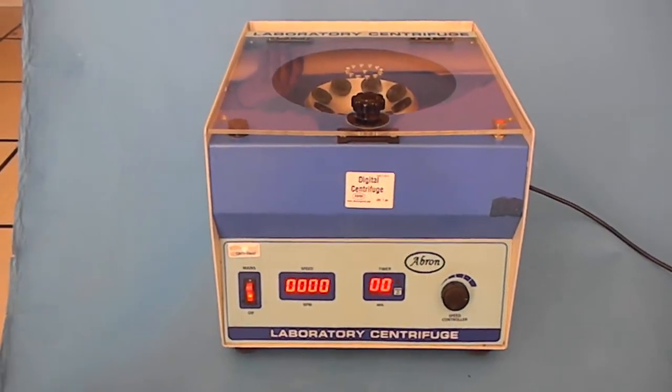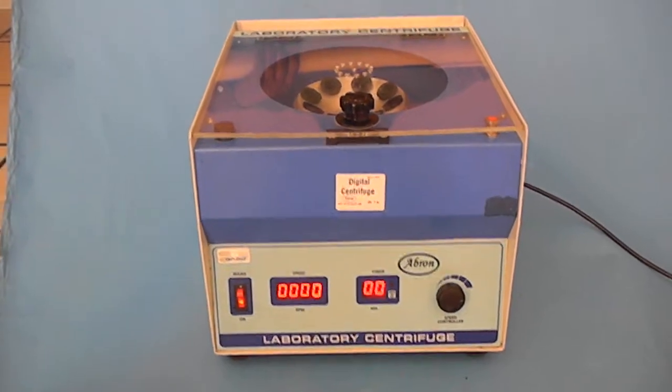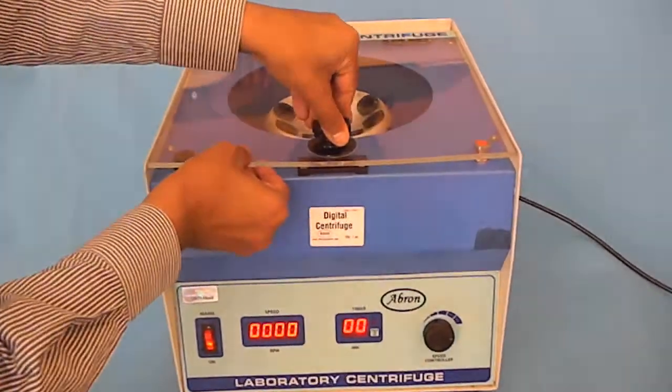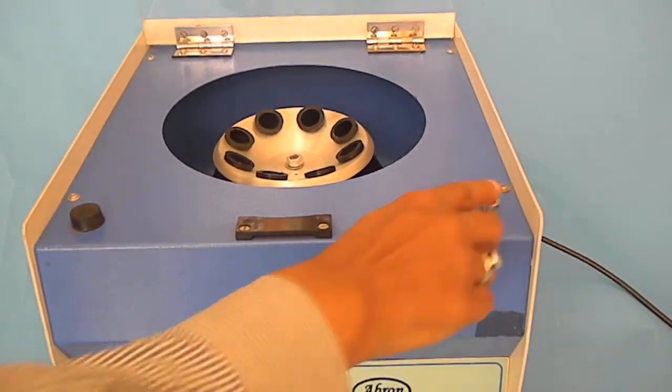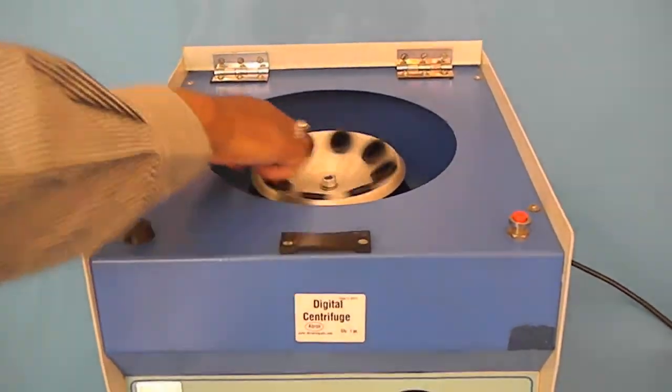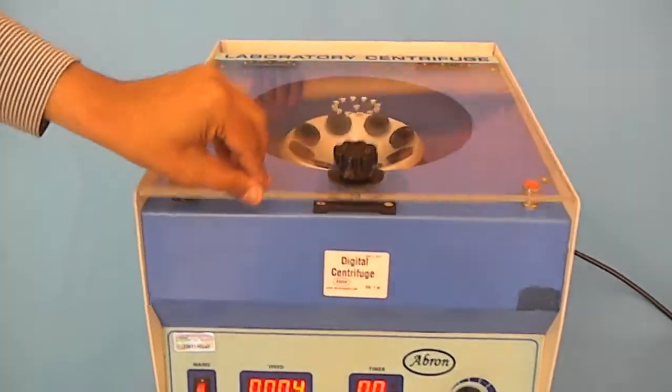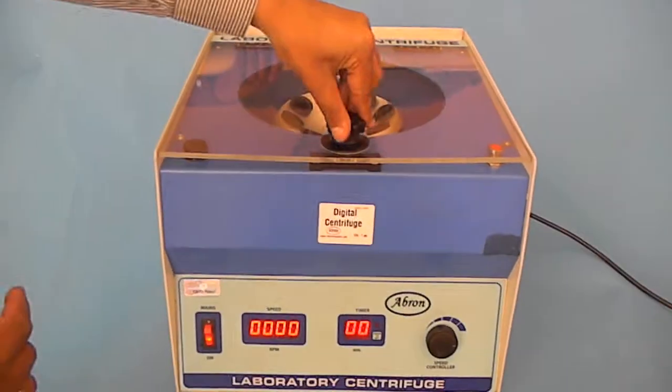This is the digital centrifuge machine with a top lid. It rotates and opens. There is a micro switch on the right side that automatically locks when you put the lid down.